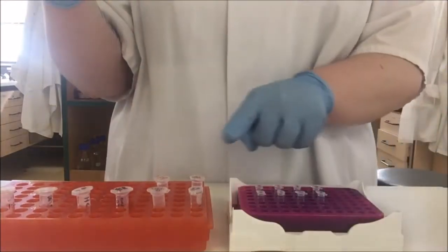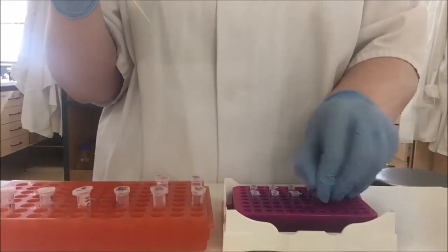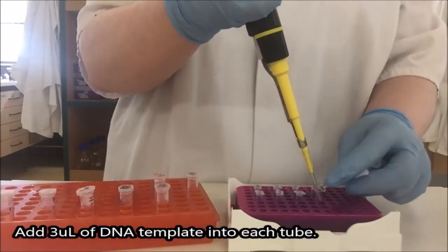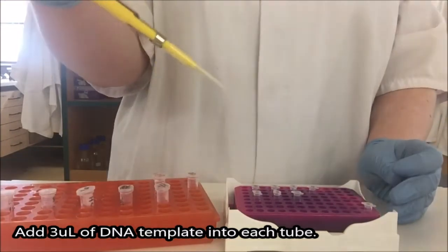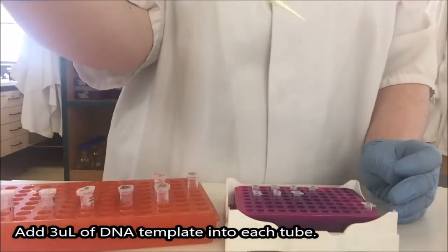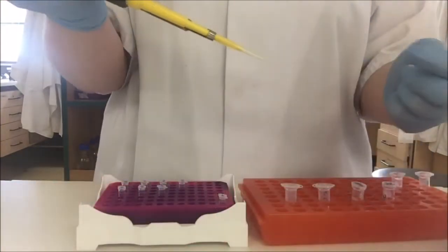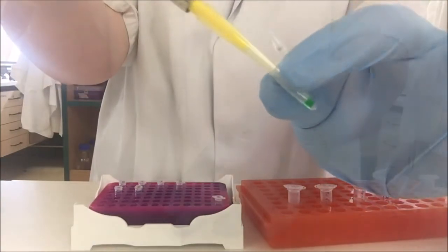And I'm going to add 3 microliters of our first sample into tube 1. As I do this, because I'm working with very small amounts of liquid, I'm going to check that I've actually managed to get everything out of the tip. This is sample number 2, PCR tube number 2. It's a very much smaller tube than our microcentrifuge tube.